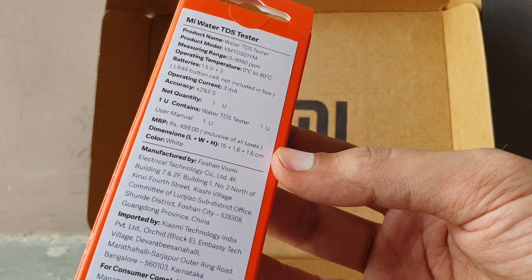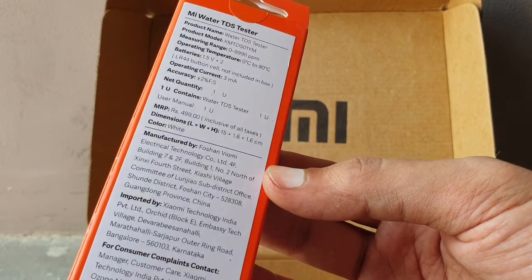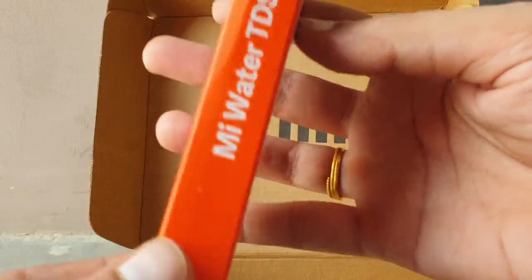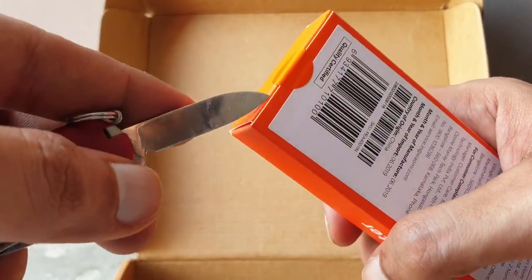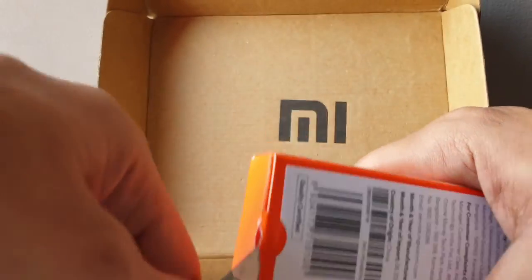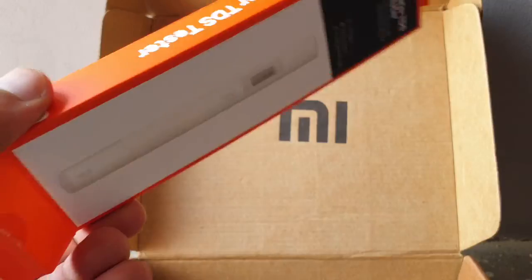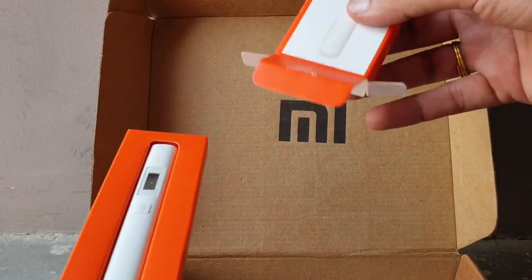The MRP is 499 rupees, but it's available on the website for 349 only. It is manufactured by another company and imported by Xiaomi. The product is made in China and quality certified. I need to use a knife to open the box.